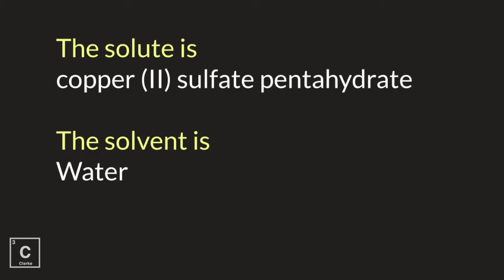Your solute is copper sulfate pentahydrate. Now guys, remember hydrates. That means there is going to be water molecules attached to the compound. Pentahydrate. There are five water molecules for every one molecule of copper sulfate. I'm only mentioning this because when you find your molar mass of copper sulfate, you have to add in those five molecules of water. So you're going to add your coppers up, the compounds that make up sulfate, and then add the mass of five waters to your molar mass.